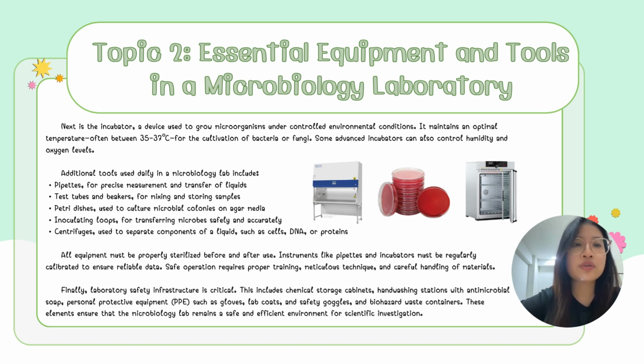This includes chemical storage cabinets, hand washing stations with antimicrobial soap, personal protective equipment such as gloves, lab coats and safety goggles, and biohazard waste containers. These elements ensure the microbiology lab remains a safe and efficient environment for scientific investigation.